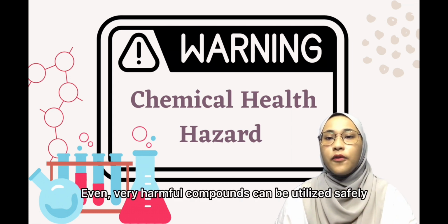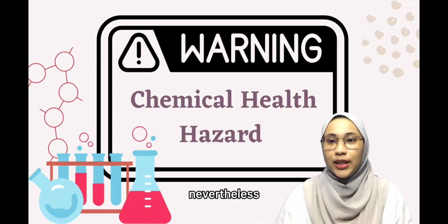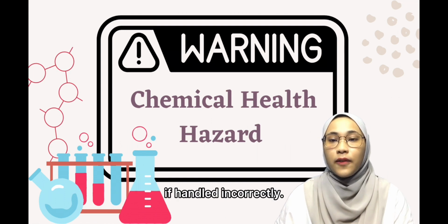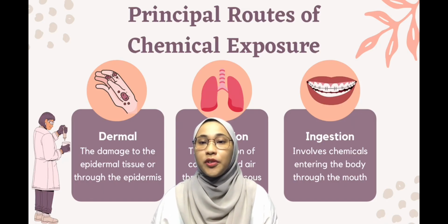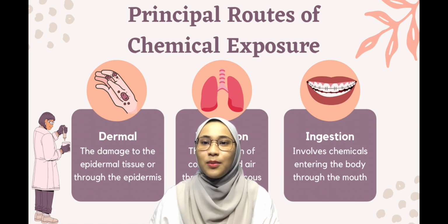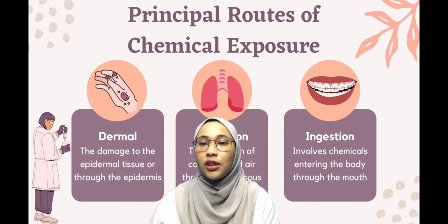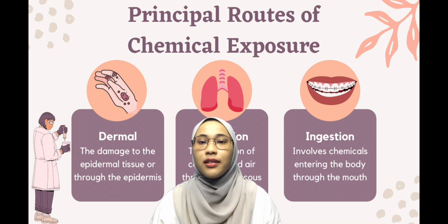Even very harmful compounds can be utilized safely with good management. Nevertheless, less harmful chemicals can be exceedingly deadly if handled incorrectly. The principal routes of chemical exposure. Before we together dig deep into this, I would like to underline that the usage of hazardous chemicals in the laboratory does not imply that they pose a health risk to you. In fact, the exposure to a chemical is actually a risk.